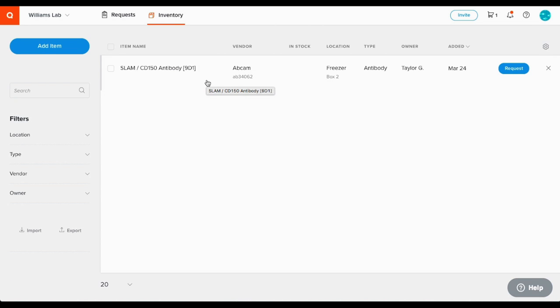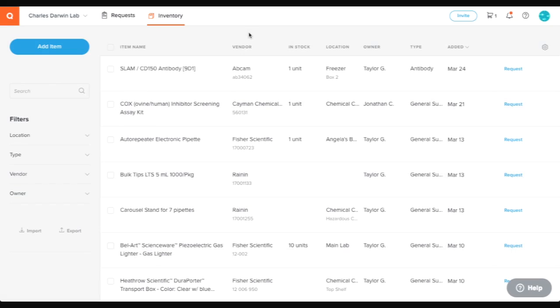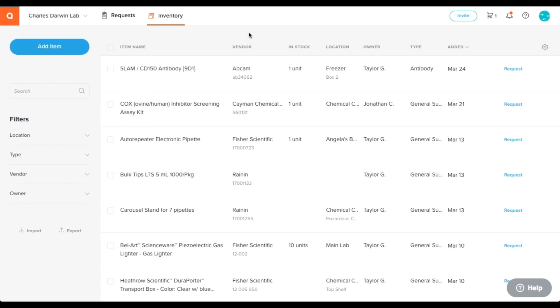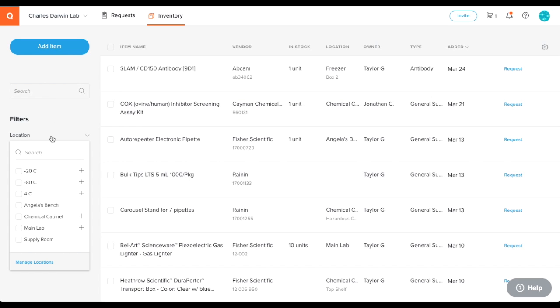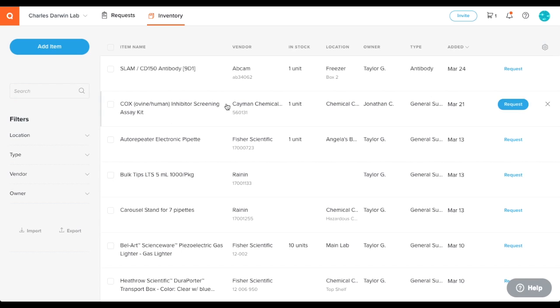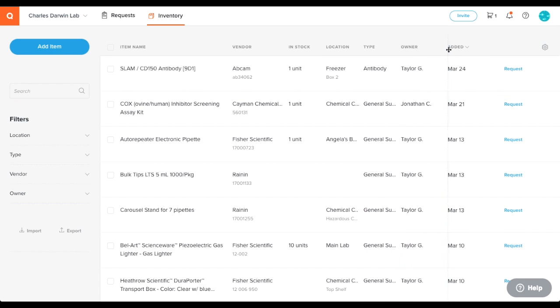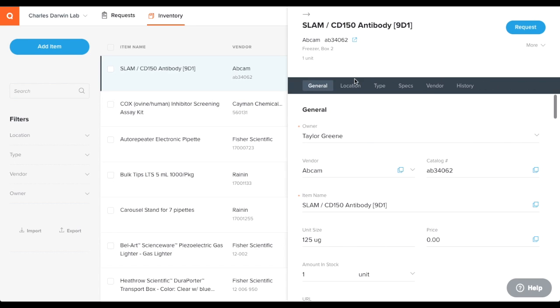Once you have items in your inventory, you can search your inventory, set filters, and even customize your view by clicking and dragging columns. If you want to edit any item, just click the item row and the details panel will appear where you can make any changes.